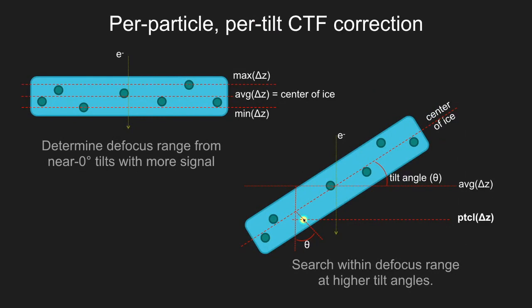And we've replicated that, but we didn't improve the resolution any further than EMClarity did, so we didn't focus a whole lot on that particular example because it's so artificial. I can get into that more if people have any questions about it. But anyway, it is possible using the technique. Mathematically, it's possible to get to near atomic resolution, or, well, not near atomic maybe, but 3 angstrom or 4 angstrom resolution using this technique.